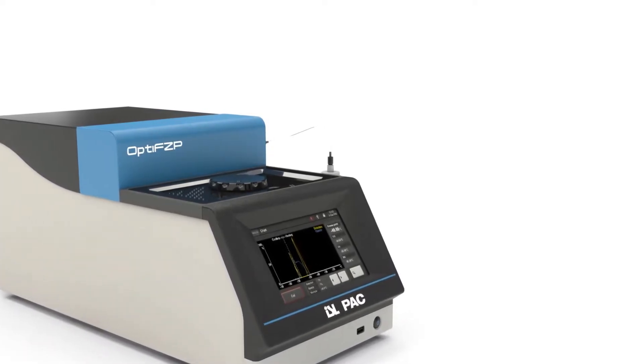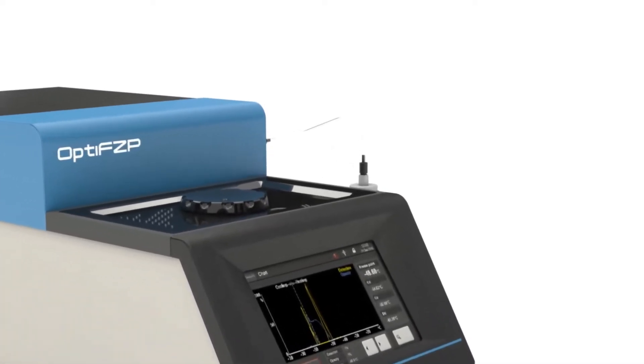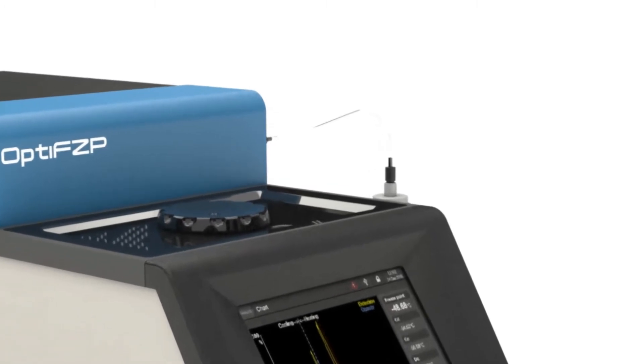OPTI-FZP is extremely simple to operate. The plug-and-play concept precludes any lengthy training to operate the instrument, which is now common across all new PAC instruments. Simply set up the sample ID and test conditions, load 10 milliliters of jet fuel into the instrument, and push the start button.